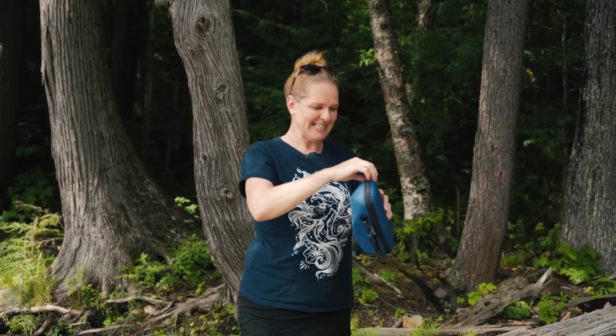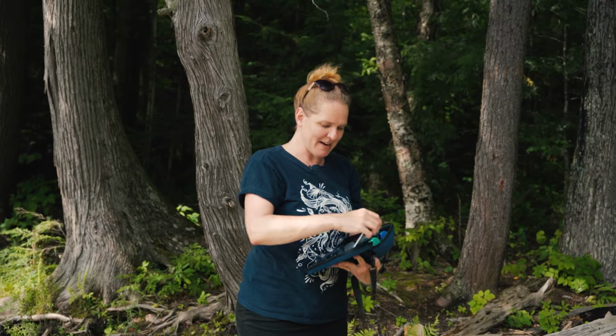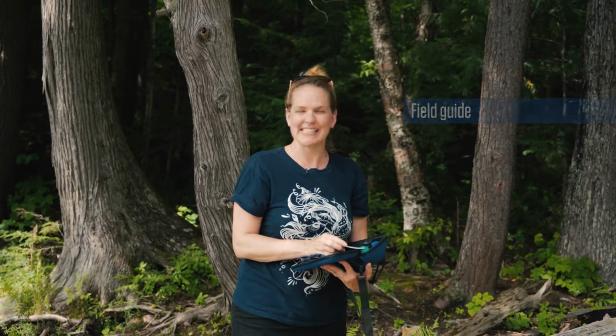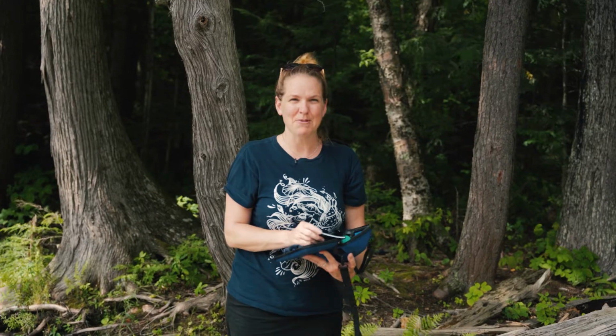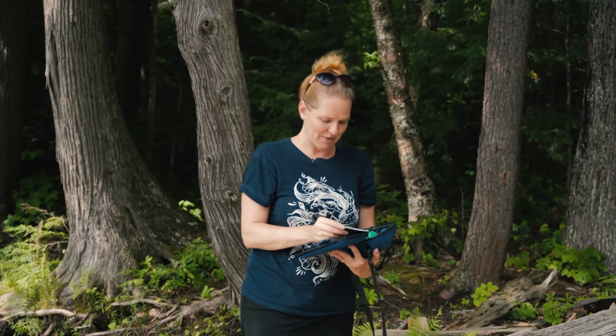When I open my test kit, the first thing I'm going to want to do is get my field guide out. This has more instructions on safety, how to choose a sample spot, all the instructions I'm going to go over right now, as well as how to put your data into our platform.